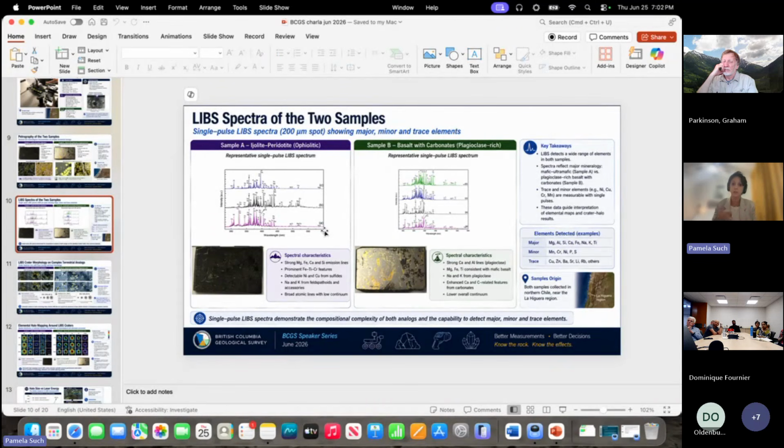So if you use another instrument after LIBS, for example Raman or micro-XRF, you're not going to be on the same surface. You're not going to obtain the correct data. You're going to obtain the elements that were created after LIBS. So you have to clean that core. Very simple.